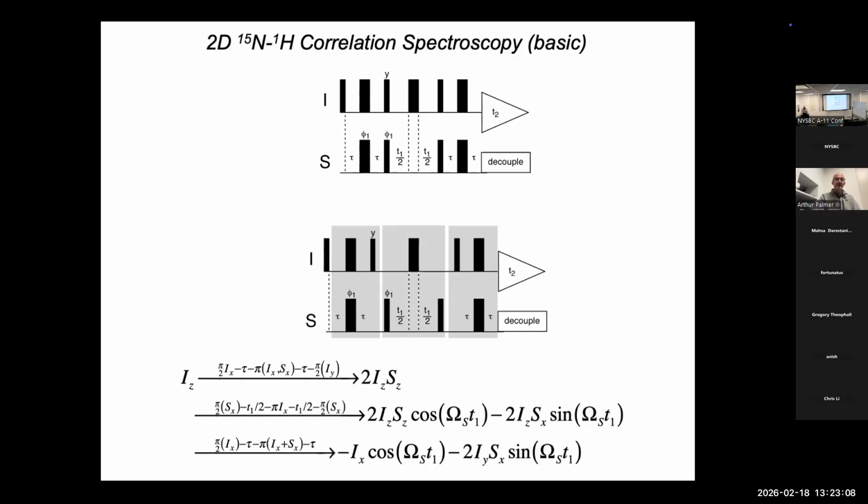So the take-home message is going to be, as we start to look at more complicated pulse sequences, your goal is to first divide them into these blocks that you recognize what's happening, so that you don't have to work out every possible product operator, right? There's no point in working out the chemical shift in this gray block because you know it's going to refocus.